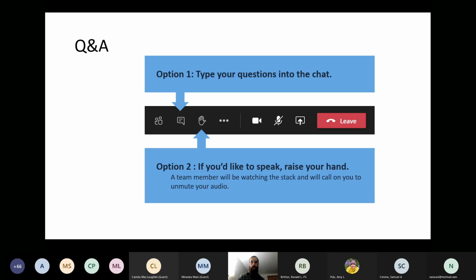What I've typically done is actually set the stringency lower for returning a result, and simply return the highest hit. And then after that, you can go through and filter from that. So for example, if your top hit has a percent identity between 90% and 100%, you then could say, what would it be hypothetically if I set that threshold at 95? So you remove all of those top hits that are below 95% identity.